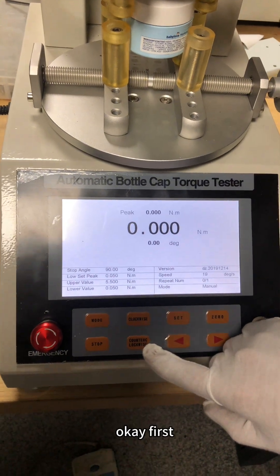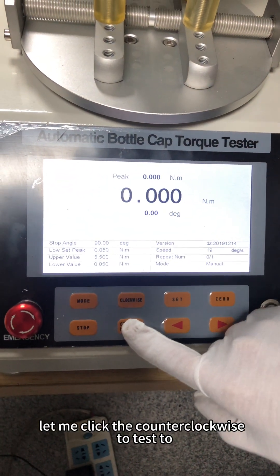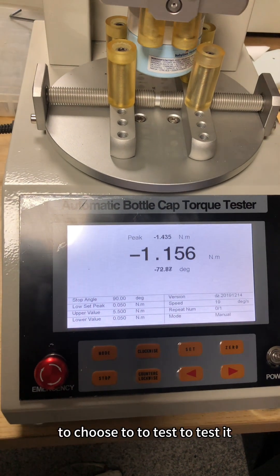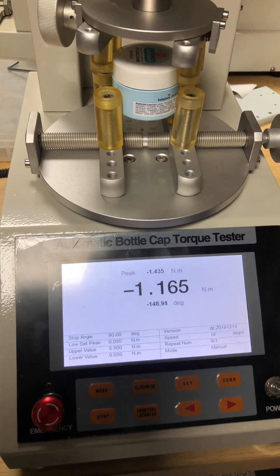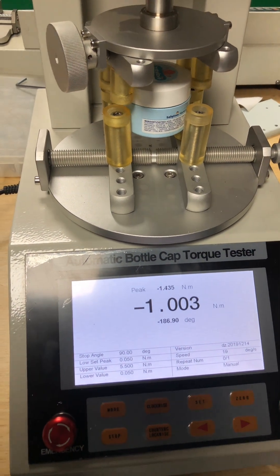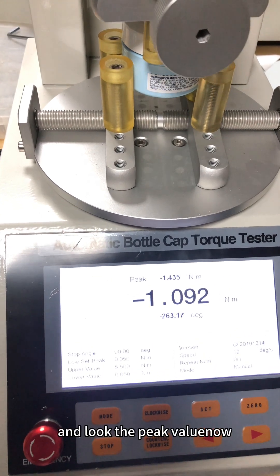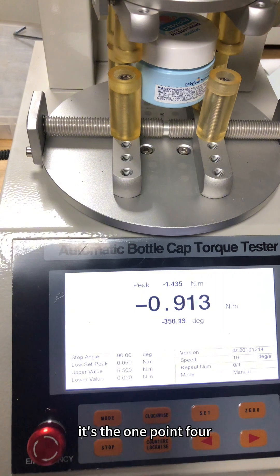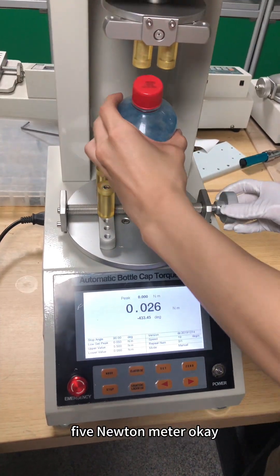Okay, first let me click counter-clockwise to test it. And look — the peak model now is 1.435 Newton-meter.